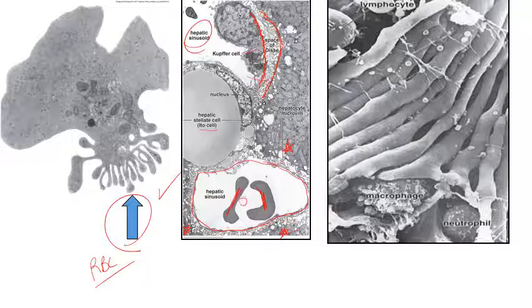So right here, we have the very iconic picture of the spleen. And the spleen has what we call barrel-like filtration slits. And these slits are a modification of the endothelium in the basement membrane of the endothelial cells. What you have is macrophages that can actually put extensions through these little slits and essentially monitor the internal environment of the closed circulation of the spleen. So whenever you see this, this is always going to be spleen. Never, ever will it be anything else. And again, we have our neutrophil with like a little snowball right here. It's got all its little projections on here, and you'll learn about that in immunology. And the macrophage has all its extensions right here, and these are all receptors to make sure that there's nothing in there that shouldn't be.